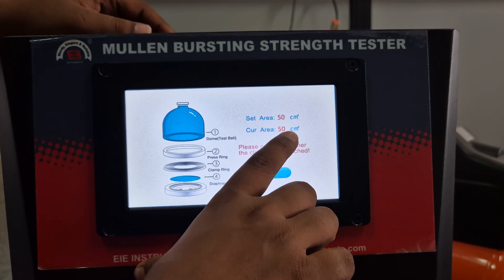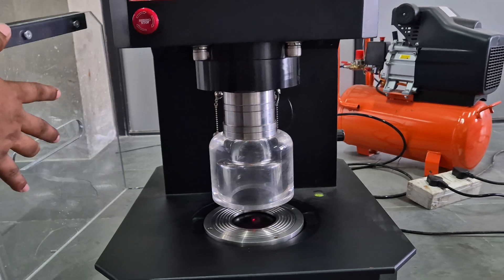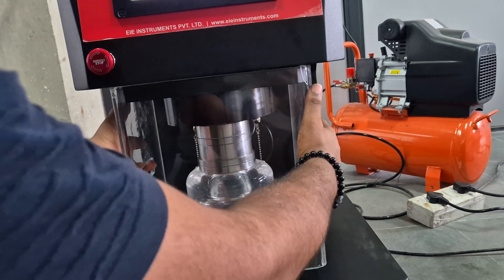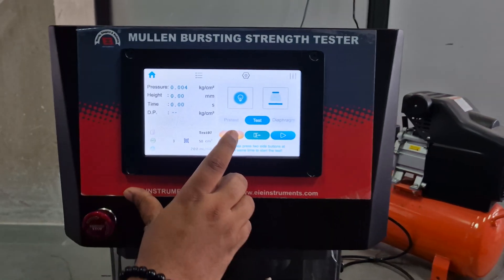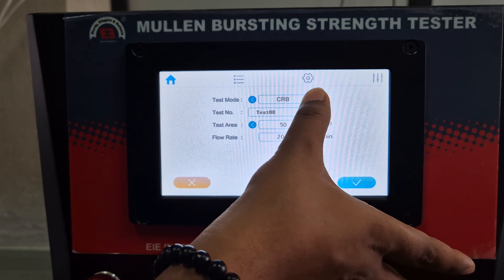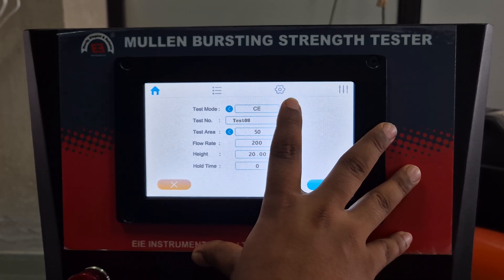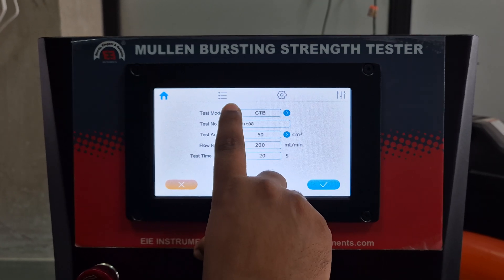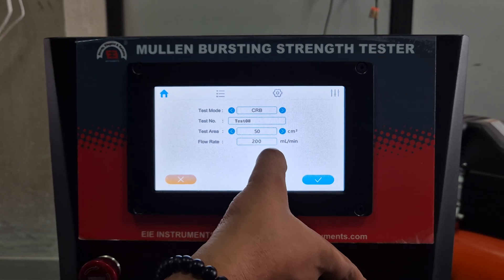Set area 50 and current area 50 — same — then we will proceed further. Now place the safety cover. From here we can select the test mode. Test mode options are: CRB constant rate burst, CTB constant time burst, CE constant elongation, and CP constant pressure. Currently we are doing CRB constant rate burst, and the flow rate is 200 ml per minute.